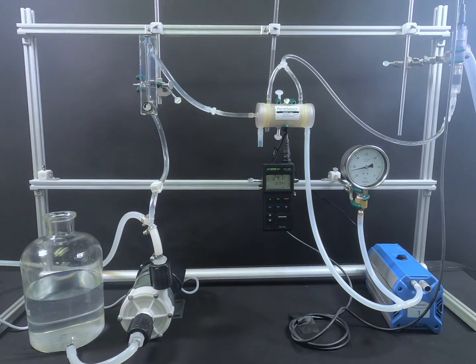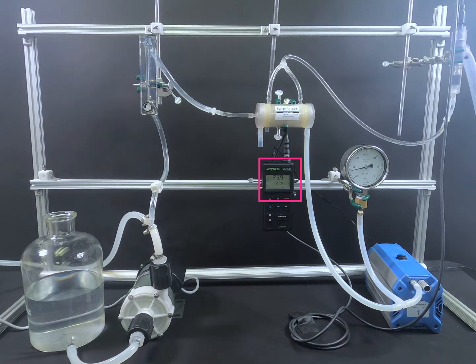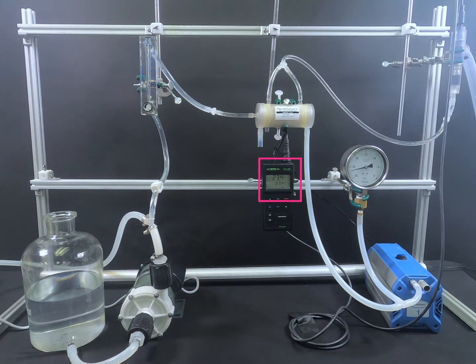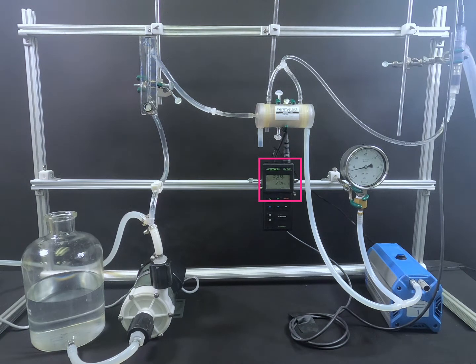As the water exits the membrane module, the dissolved oxygen percentage drops nearly 80%, currently reading 23.4% dissolved oxygen.